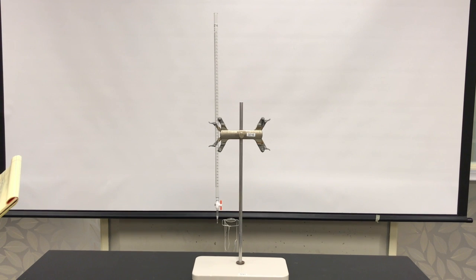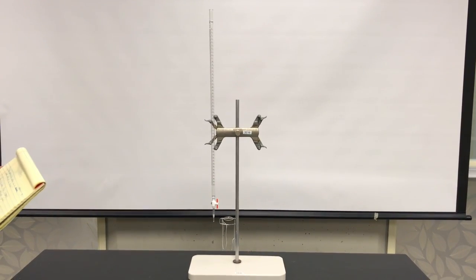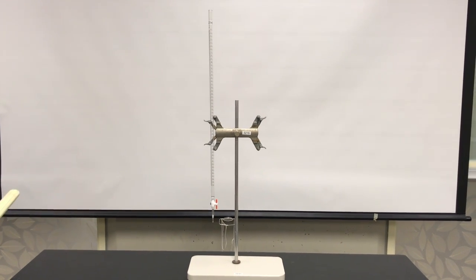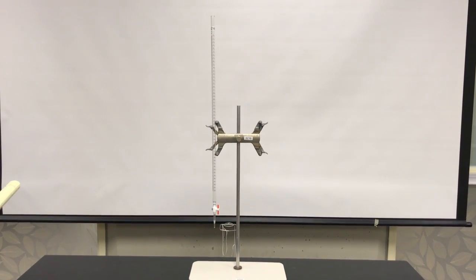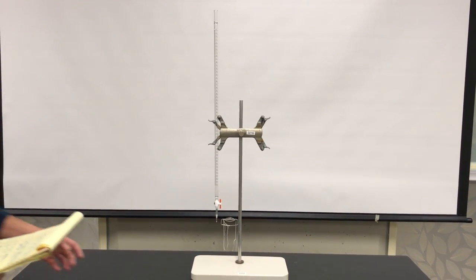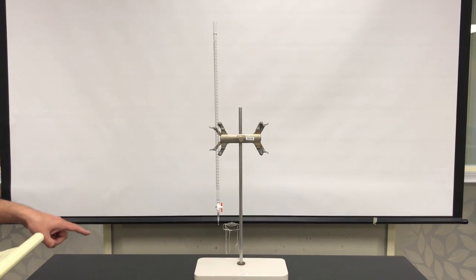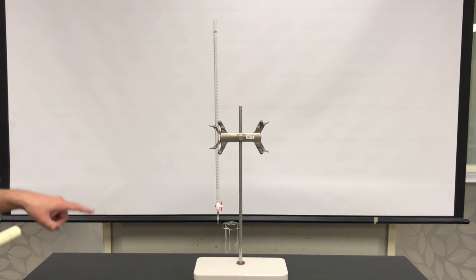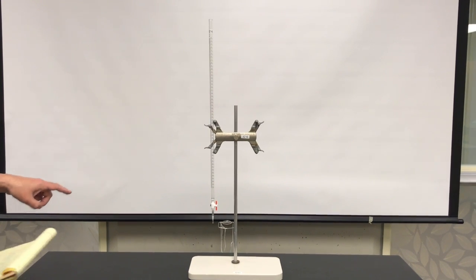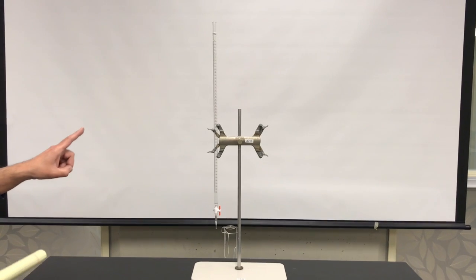The goal of this video is to show you how to use a burette. The plan is that we're going to have the burette set up for you before you come to lab. You should find your burette set up on a burette stand which has a white ceramic base, and the burette will be held in place by a burette clamp that's spring loaded.